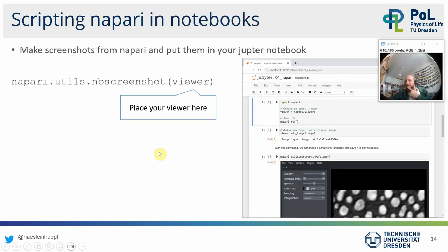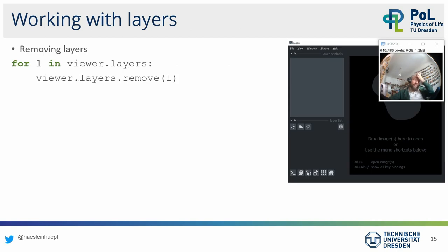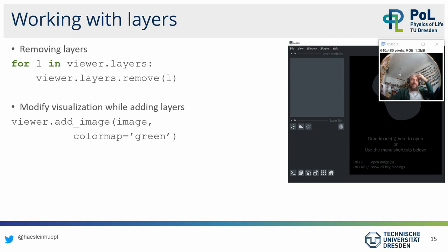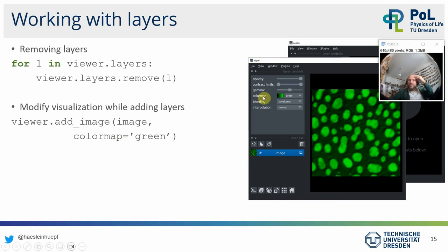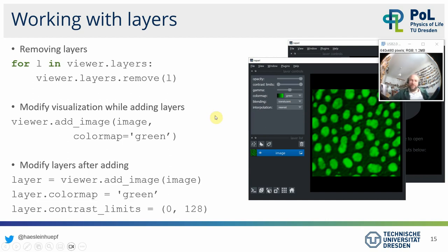When working with Jupyter notebooks, you can take a screenshot using a specific command, which is useful for documenting what a user annotated before additional processing steps. You can remove layers with a for loop. You can also pass parameters like `colormap='green'` to `viewer.add_image()`, which will choose that particular lookup table. If you collect the result of add_image in a variable, that layer object has properties like `colormap` and `contrast_limits` that you can change afterwards.